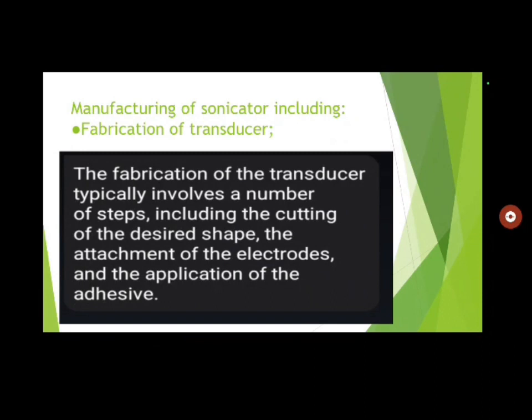Manufacturing of the sonicator, including fabrication of the transducer. The fabrication of the transducer typically involves a number of steps, including the cutting of the desired shape, the attachment of the electrodes, and the application of the adhesive.